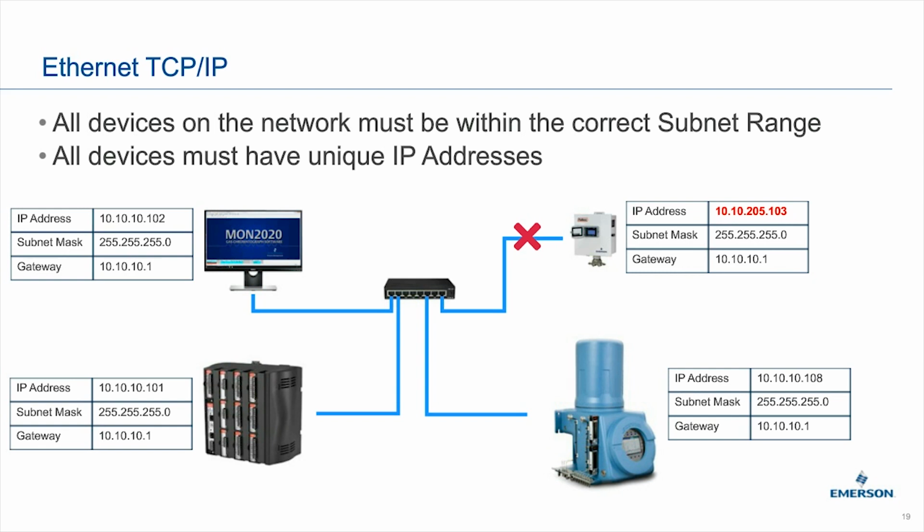So you can have one device talking to a GC with 232, another device talking with 485, and another device or many devices talking over the Ethernet protocol. So there's no problems, and they're all separate. They're all unique Modbus maps, and so you can actually have one serial port set up for one Modbus map, the other serial port set up for a completely different Modbus map, and the Ethernet set up with a different Modbus map as well.